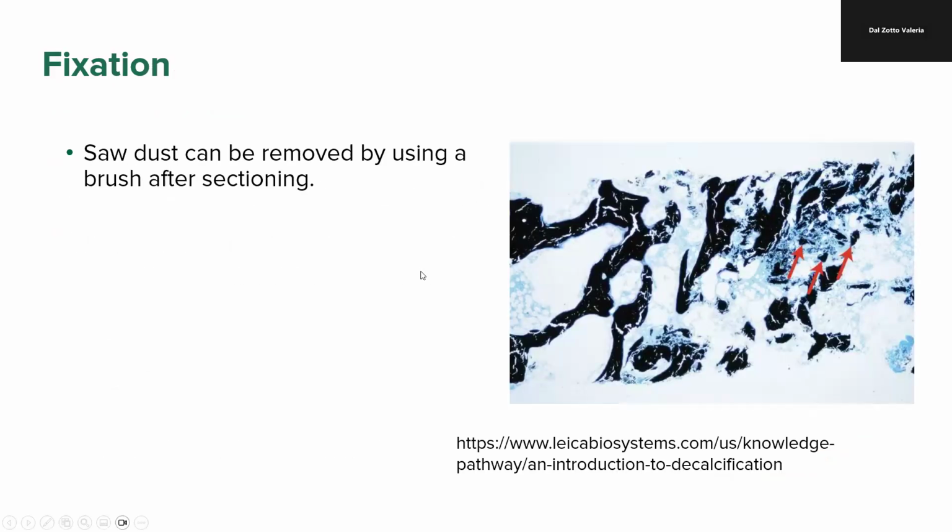So when you cut your piece of bone, certain saws, the most frequent saws that we use, are going to leave sawdust. We call it sawdust because they're going to leave speckles of bone in between the real specimen. So make sure that you brush appropriately, and we are going to practice this in the future, avoiding the sawdust in the specimens. Why? Because this sawdust is easily confused with bone necrosis under the microscope, and we don't want to overdiagnose bone necrosis.